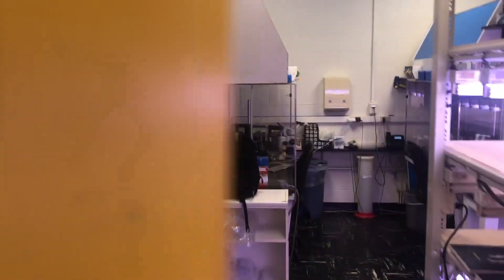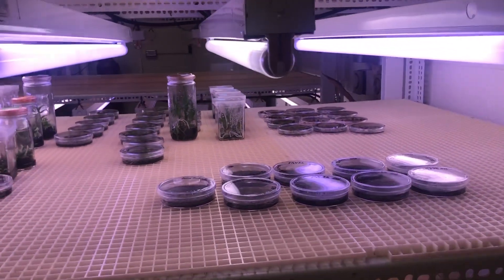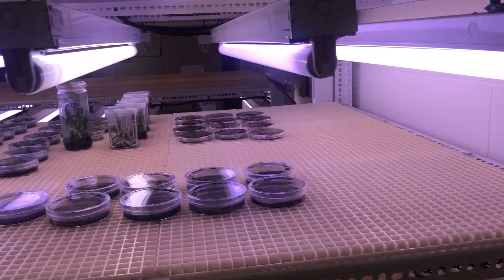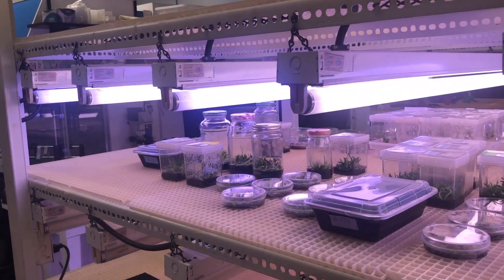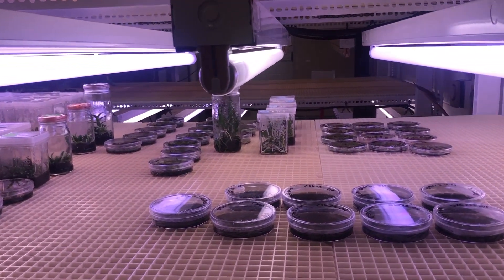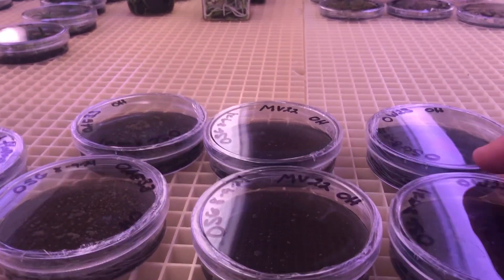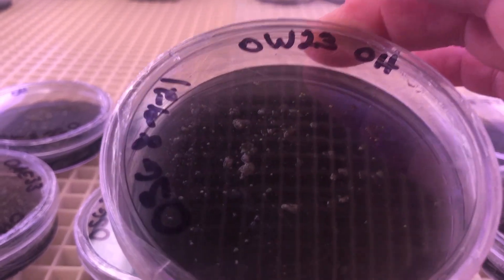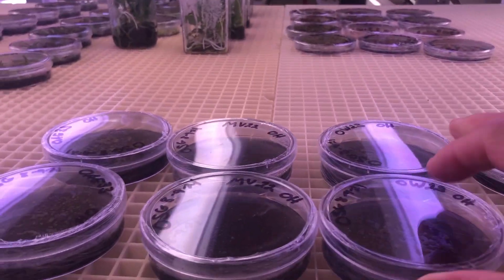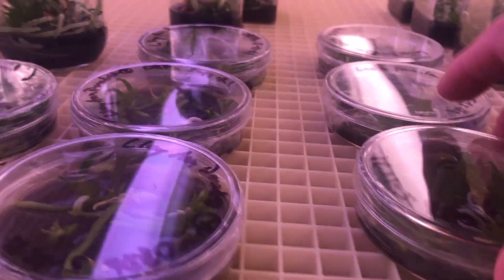Let's go into the culture room right here. This is the culture room — it has independently controlled air conditioning and heating from the rest of the building. This is one of the shelves with very controlled light, temperature, and humidity. These are some of the orchid seeds that I plated. You might be able to see some small green spots — those are seeds that are just starting to swell.